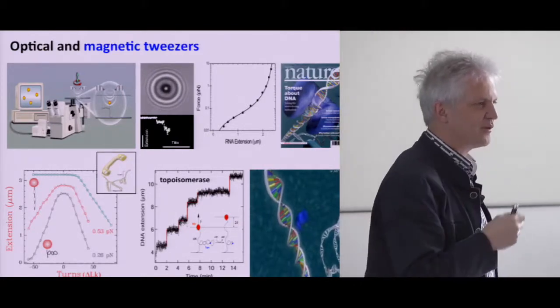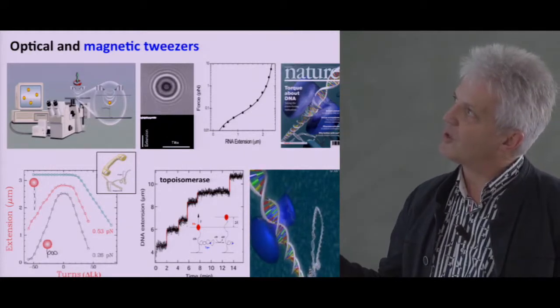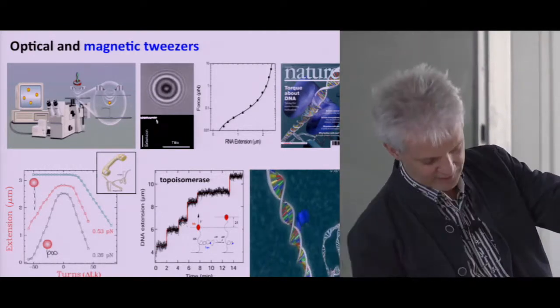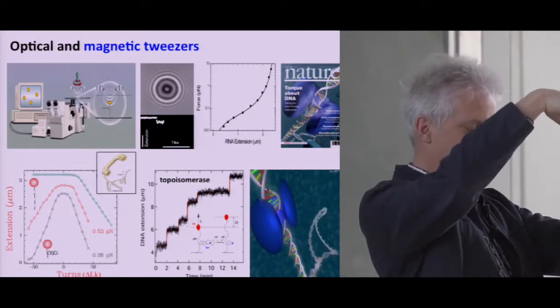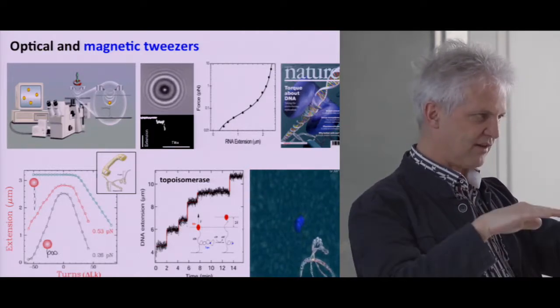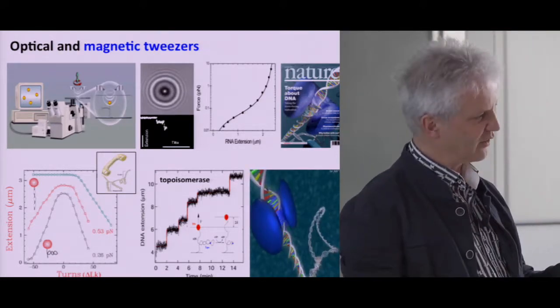One famous one is also the one developed here at ENS by Vincent Croquette and David Bensimon: magnetic tweezers. It is another example where you take a simple microscope and you look at a bead which is attached to a DNA molecule. That's such a simple device. You take a DNA molecule and with some chemistry you attach a bead to that molecule, and at the other end you attach it to a surface, and then by having a magnet on top you can pull that bead up and in that way exert a mechanical force on the DNA molecule, and measure from the position of that bead. By applying a certain force, you can do a stretching force, higher force and then lower force. Basically, you can investigate the mechanical properties of DNA.